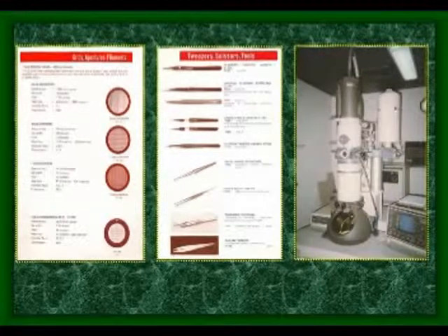The staining here is entirely different, not the same as for light microscope studies. In electron microscopy studies, there is a special stain known as the positive stain. This positive stain is the combination of uranyl acetate and lead citrate. How to prepare this uranyl acetate and lead citrate?